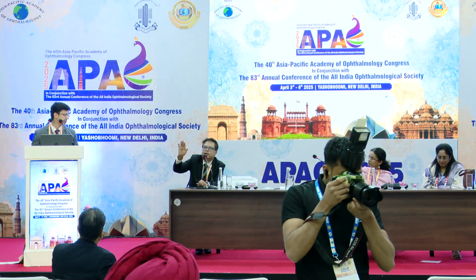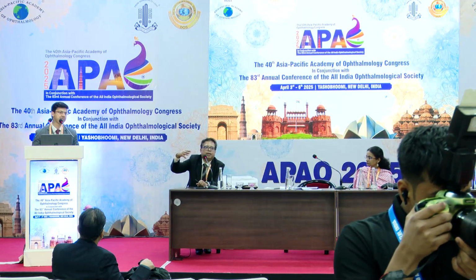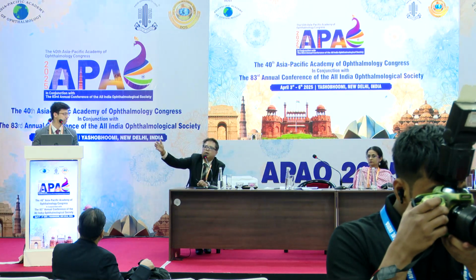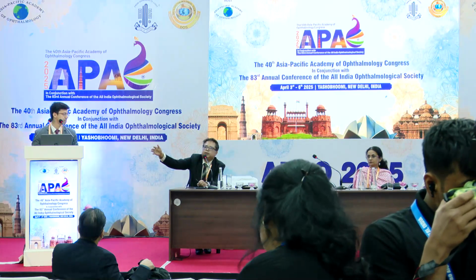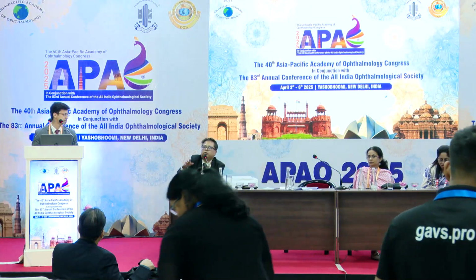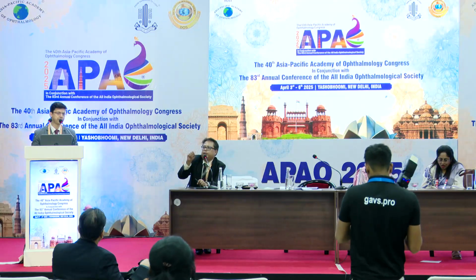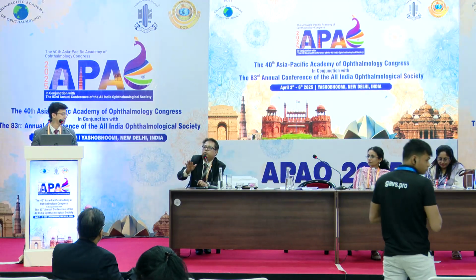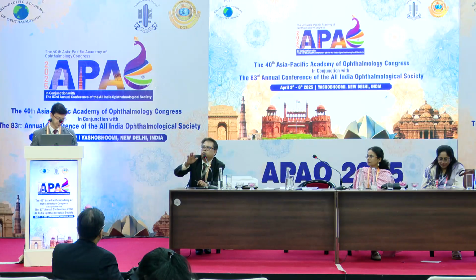Well, I would like to add, if you see a diagnosis of IOID, for pathologists, GMS, tissue gram stain, and AFB must be done to tell that it is an IOID. And CD3, CD20, or CD138 for plasma cells, and the IgG4. So this question is very relevant. As a pathologist, she's asking from the pathologist's point of view. Here we have to do GMS for fungus, we have to do tissue gram stain, and we have to do an AFB stain to tell that it is an IOID. Thank you, Soumya.